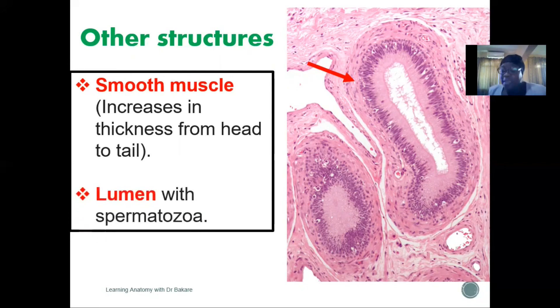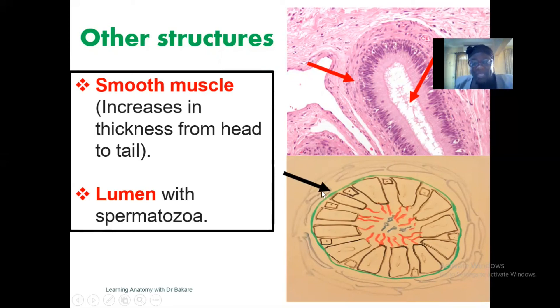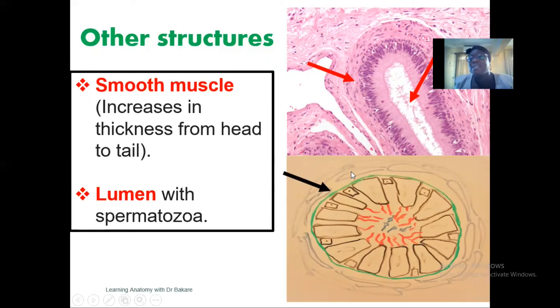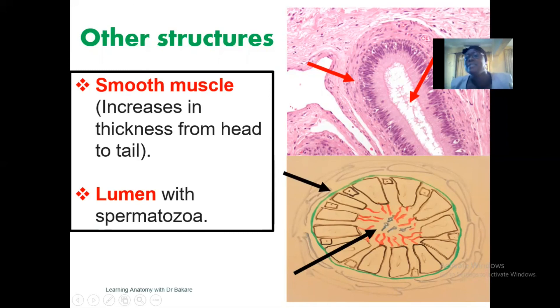The other structure is the lumen at the central part of the epididymis, where we see clusters of sperm cells. In the handmade diagram, the smooth muscle fibers are seen covering the entire outer surface of the epididymis. The thickness increases from the head down to the tail to enhance peristaltic movement, creating the force to push sperm down the tract. Within the lumen we have stereocilia directed toward it, and also spermatozoa ready to be moved down the ductal system.